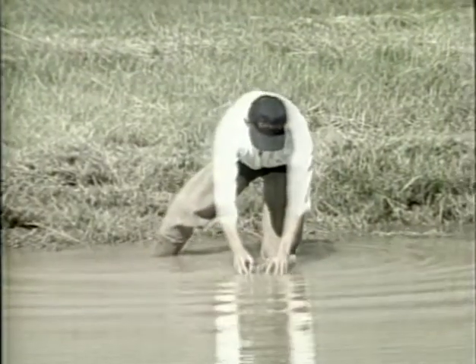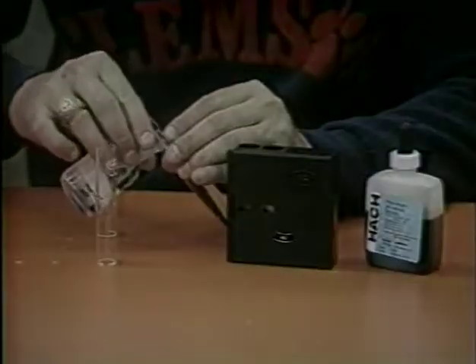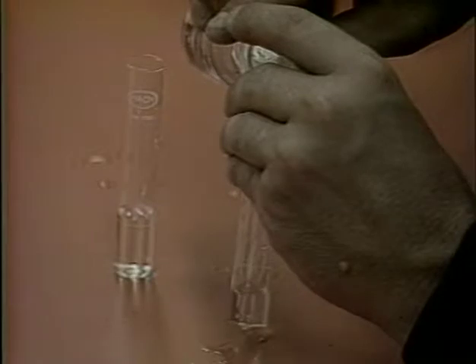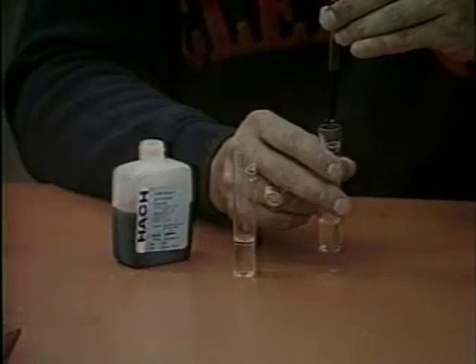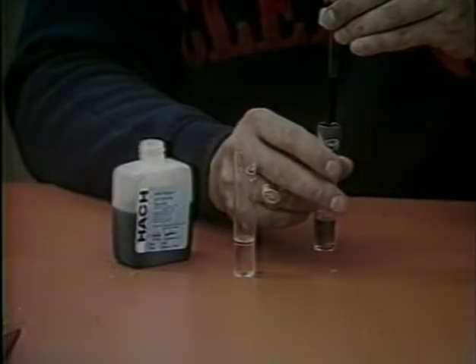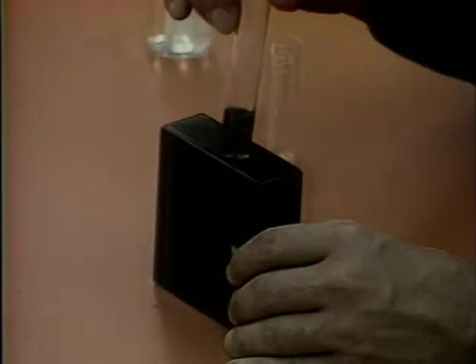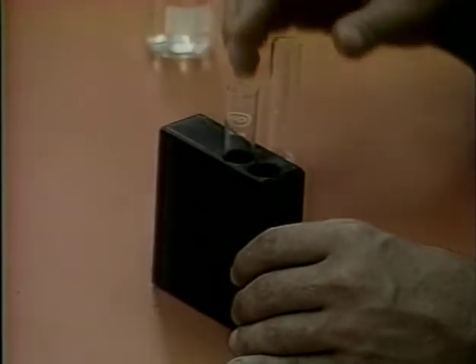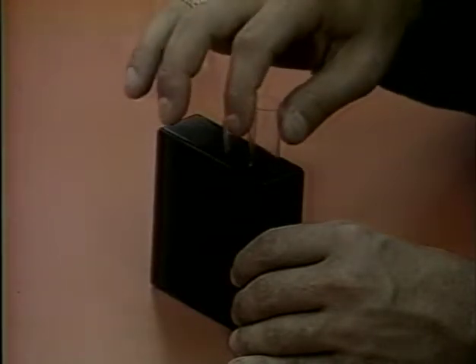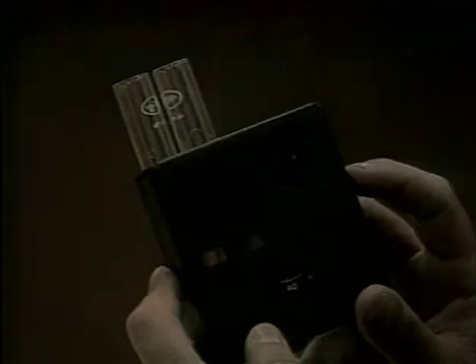Obtain a water sample away from the pond bank in a clean jar or bottle. Rinse the 2 color viewing tubes with the sample water. Fill each to the 5 ml mark. Add 6 drops of wide-range pH indicator to one of the tubes and swirl to mix. Insert the tube into the opening on the right side of the color comparator. Insert the other tube into the left opening. This tube is the untreated sample and simply cancels out any color resulting from the pond water.